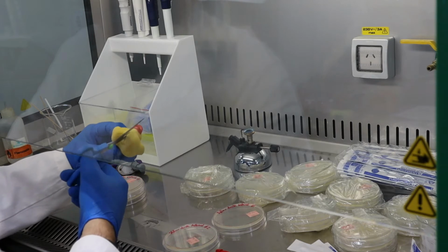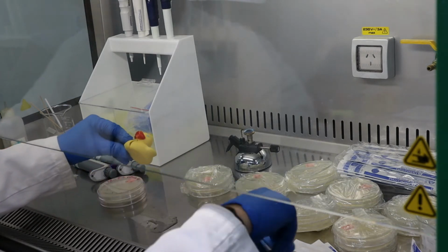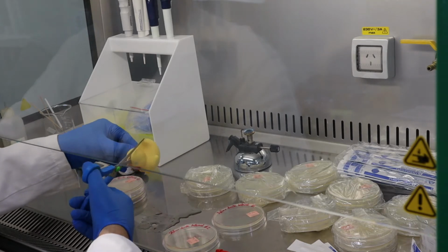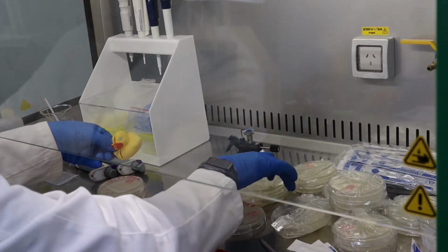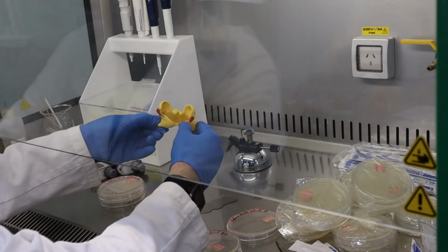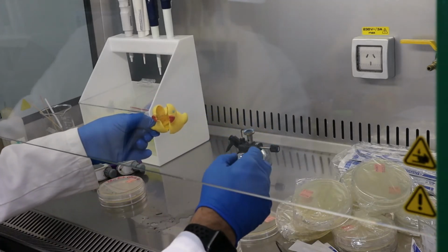Actually, it's very easy. Whoa, yuck. All this material has just come out of the duck. Lucky I'm working in my biohazard hood. I might just move my other Petri plates that we're going to use for the rest of this. And I've got to show you, I'm really surprised. Inside this yellow duck, you might be able to see that there is a lot of biofilm formation in there.